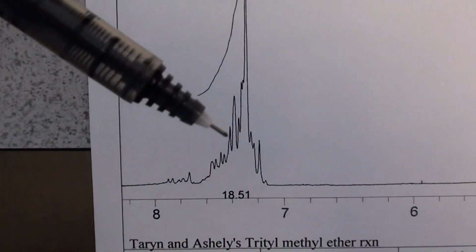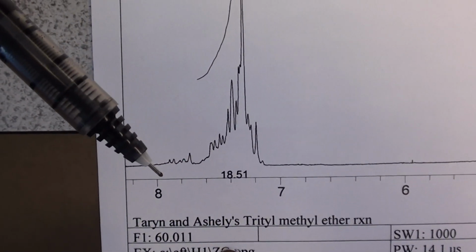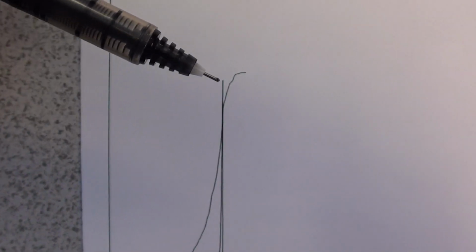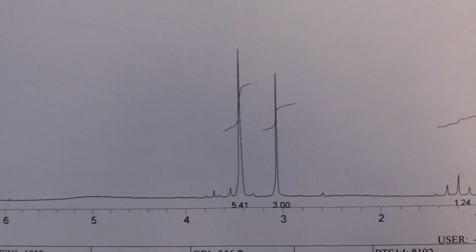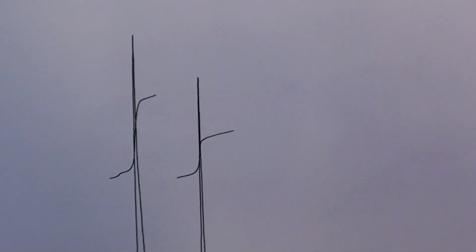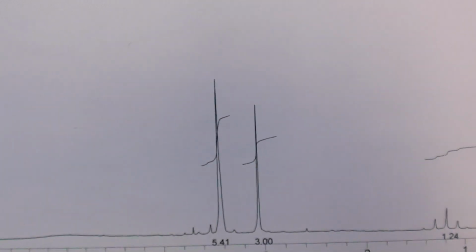How do I know they have starting material? Look at this. You can see a little bit of leftover benzophenone, right? Remember the student above? Totally flat in here. The broad forest structure is the product, but that pervasive giant singlet is leftover starting material. So this is very common to see happening. You may even see a few extra peaks, but it's very common. And the idea there would be to try and integrate, like this one, we have integrals from the ratio of methanol to their product. So we could at least correct their yield for methanol, for instance. The diethyl ether, yeah, there is an integral there. You could correct for that too. But that's the gist of it.